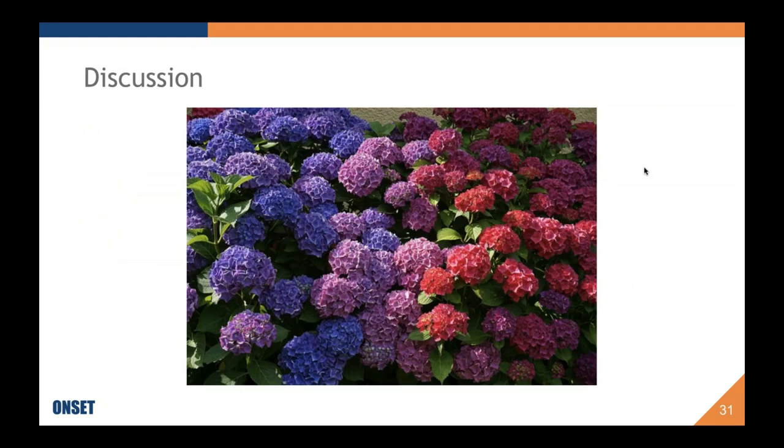Okay, at this point, I'd like to open it up for any questions, comments, concerns, and I'm going to read through the questions right now and answer what I can. Is it best to calibrate the logger at the temperature you anticipate seeing in the field? Yes. I made a note, Sean Turnin, to email you some reference information about slide 20. We'll see what else we can dig up and get over to you. I will personally follow up with an email or a phone call over the next day or two to address that.